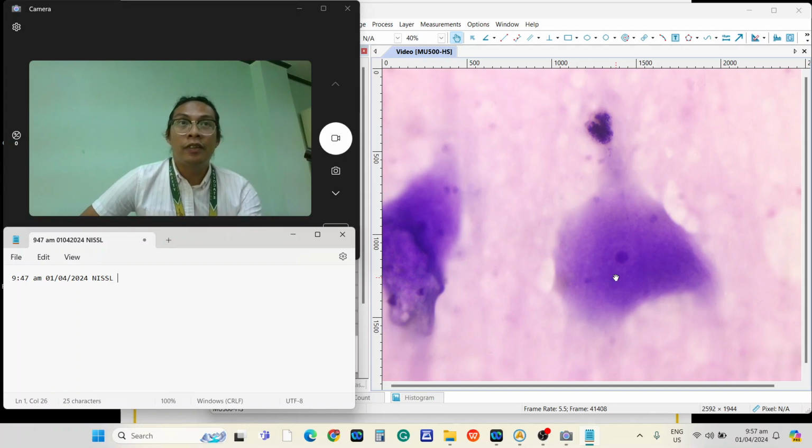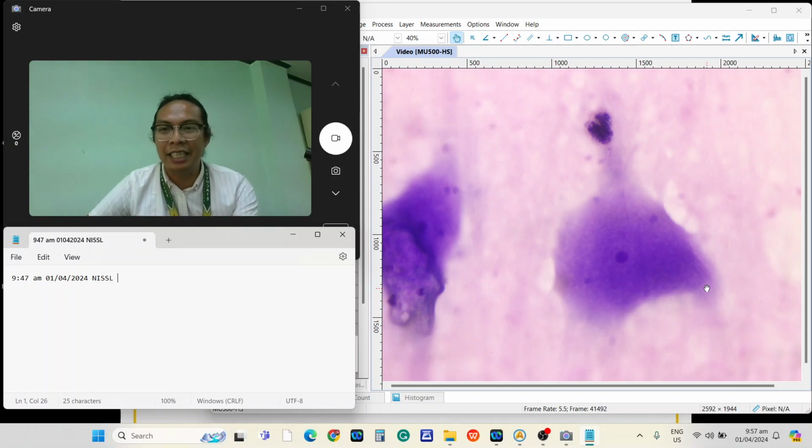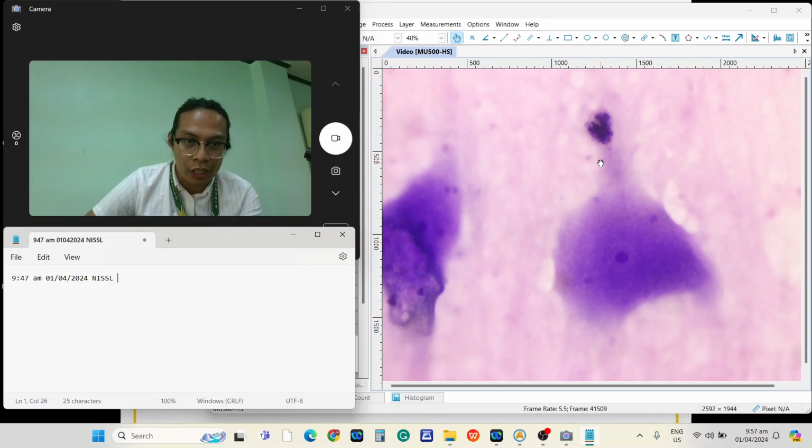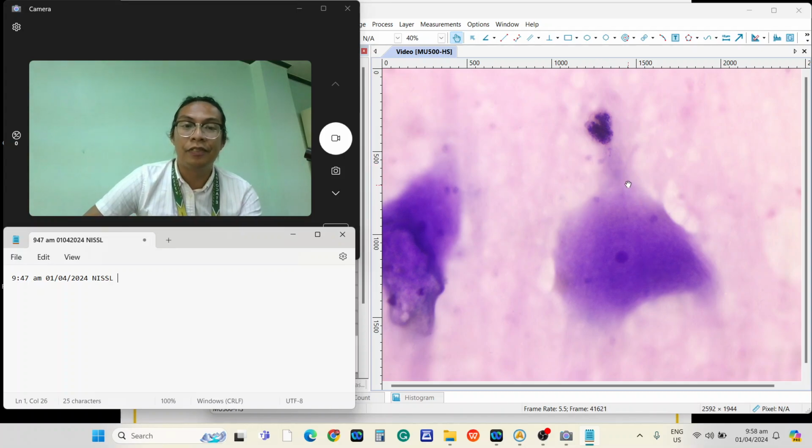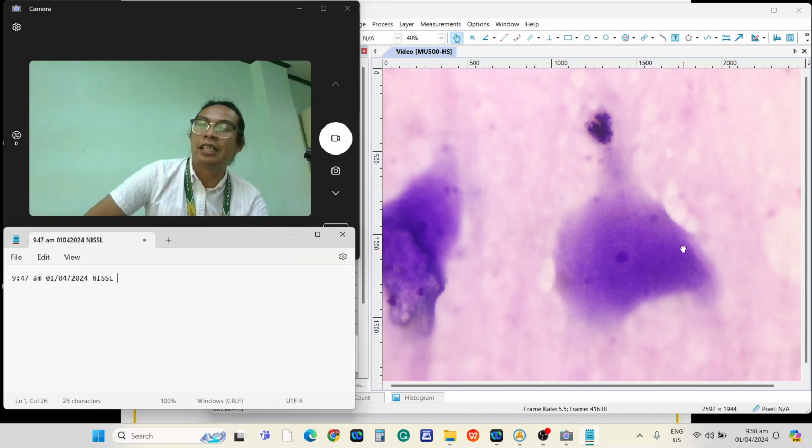Okay, usually the one neuron contains one axon and a variable number of dendrites. Okay, so this is the axon and these are the dendrites. Paano natin na-appreciate or nasabi na yun? Kasi meron siyang axon hillock. This is the axon hillock. Okay, so dyan nagsisimula ang axon. Yung axon hillock typically is devoid of Nissl bodies. So they would appear lighter in color. Okay, so this is again the axon hillock and this is the Nissl substance.